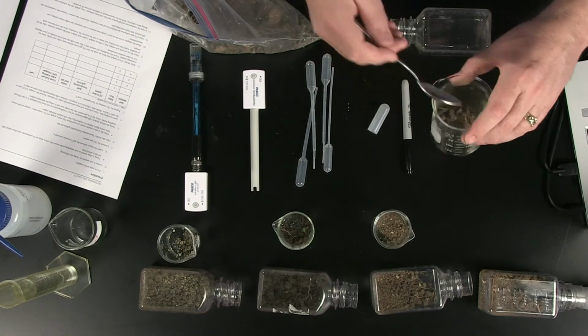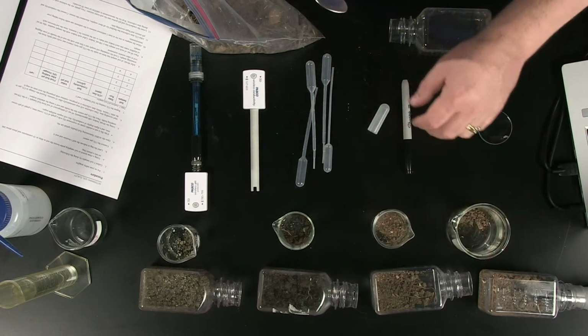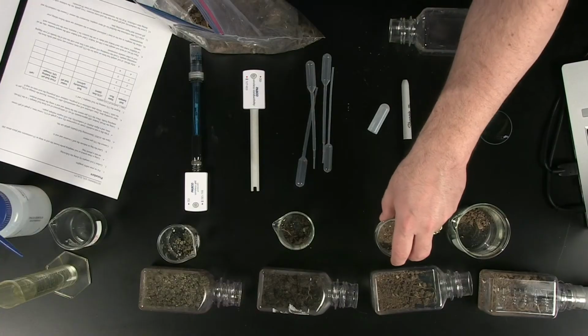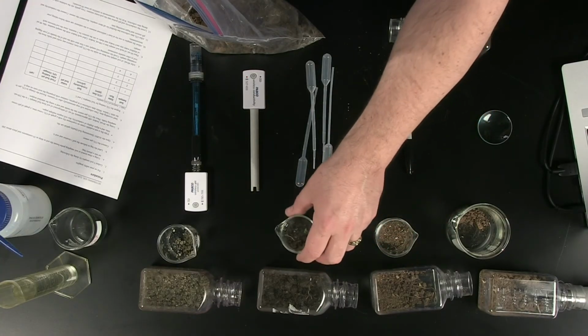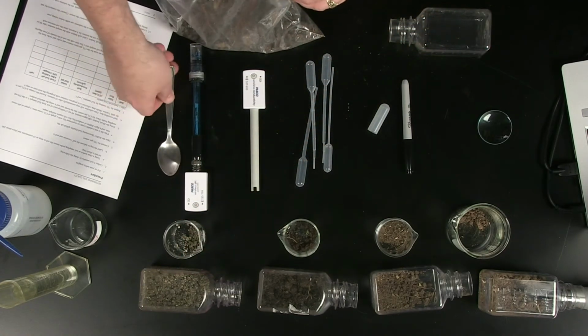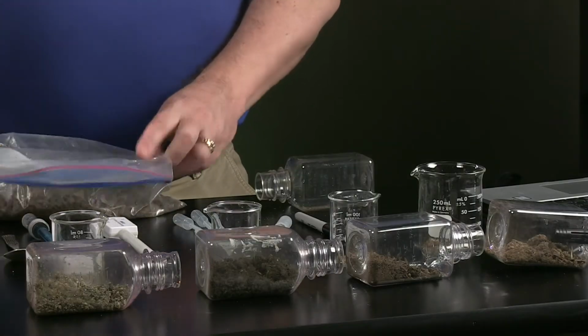Okay, we're going to put those in the bottom of a beaker. Here we have our soil from the trees underneath a set of pine trees. And this is soil that's in a potting bed. And then this is soil down by the creek. It's a lot more sandy, you can see. So now we each have the soil amounts in there.